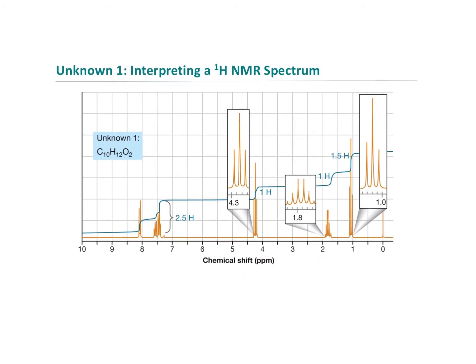One of the things that I can see here is that we really have four distinct areas, right? We've got a triplet here. That's a multiplet. I think he calls it a sextet, but it's really a multiplet. Then we've got another triplet here. And then this mess down here, that indicates an aromatic ring. So when you look through your packet, if you see a mess down there, that's what we're looking at as the aromatic ring.